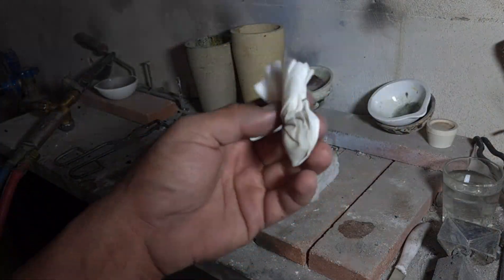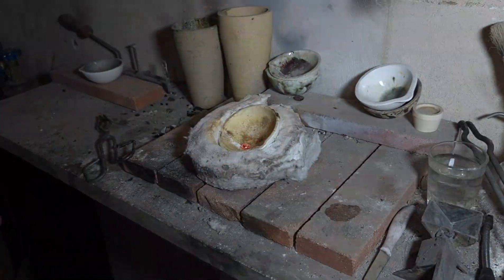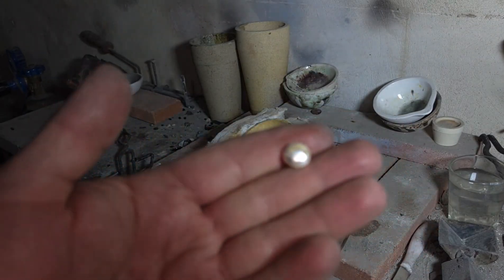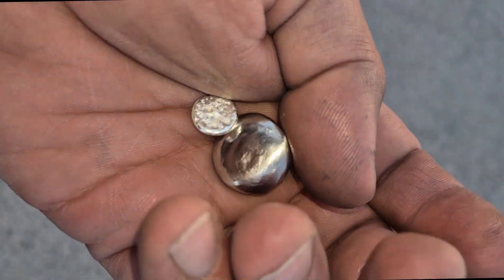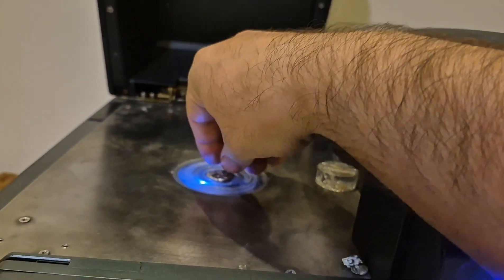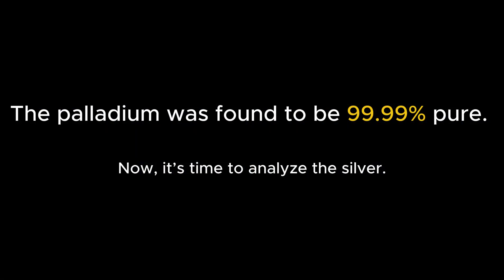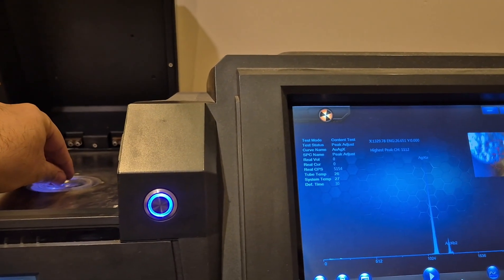After melting the palladium, I proceeded to melt the silver recovered from the silver chloride during this process. Here are the two metals after cleaning, and next I carry out XRF analysis on them.